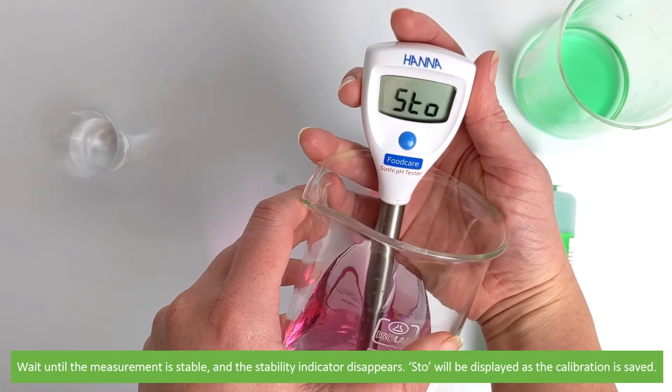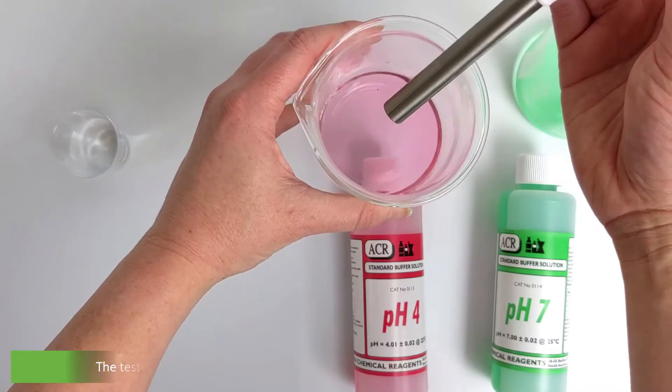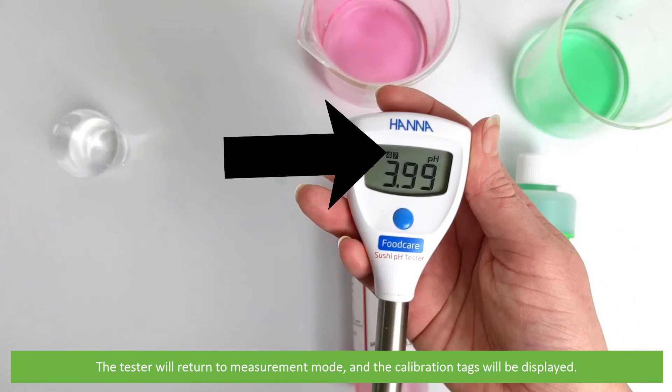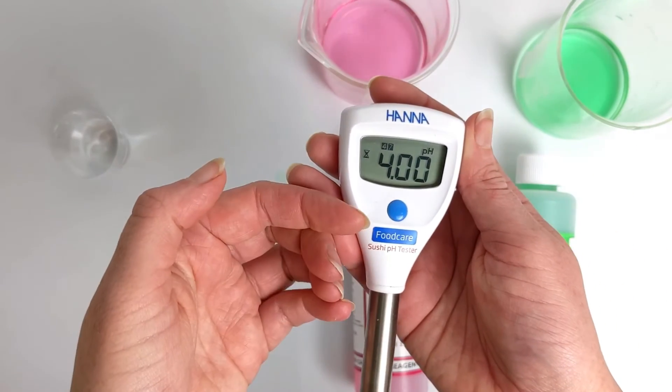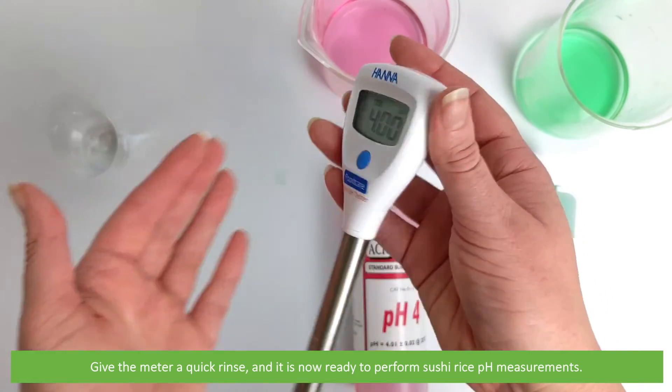STO will be displayed as the calibration is saved. The tester will automatically return to measurement mode and the calibration tags will be displayed. Give the meter a quick rinse and it is now ready to perform sushi rice PH measurements.